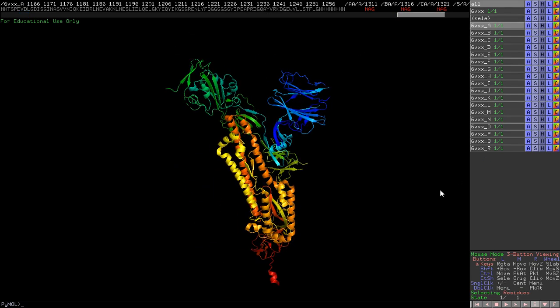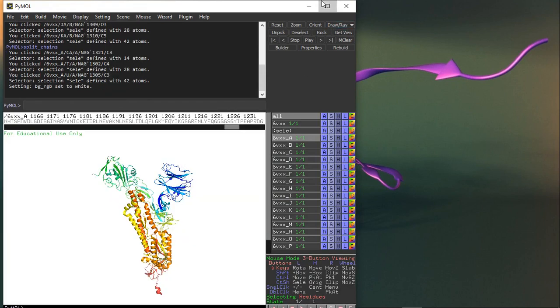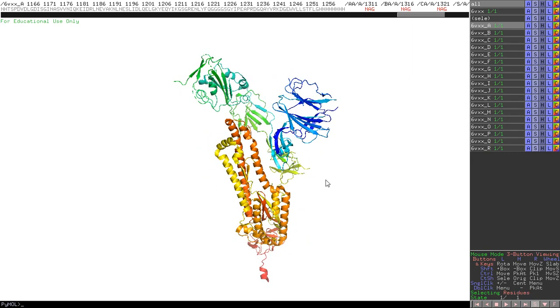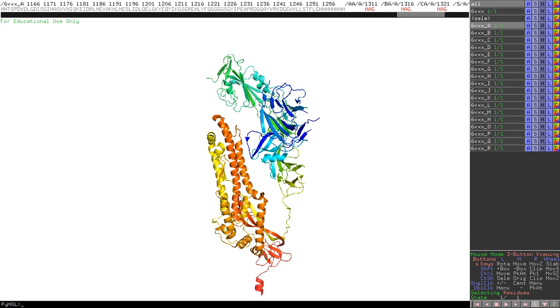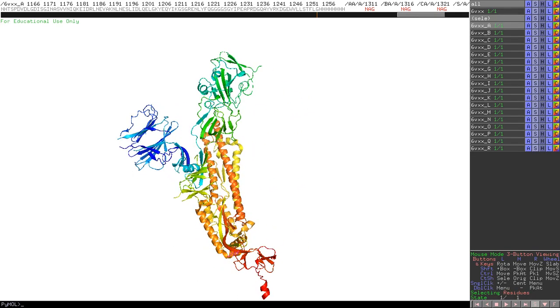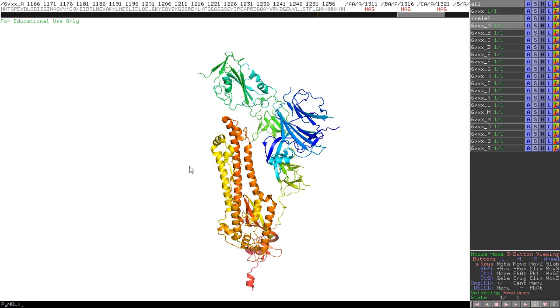If you would like to change the background, either input some script or go to 'Display', then 'Background', then 'Color White' - as simple as that. So with this slide and the presentation, I have given information about how to use PyMOL to get information about the protein structure - the monomeric structure of the spike glycoprotein, what is the first sequence, what is the last sequence, and how to deal with this protein to get information about the COVID virus. In the next class I will get more information on how the spike protein interacts with the human ACE2 receptor. Thank you.